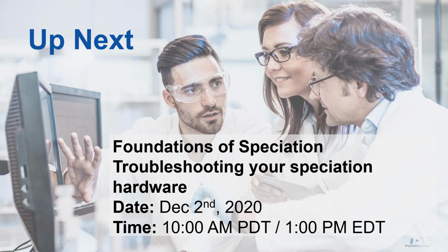Okay, and I know we're past the hour, but we've got a lot of good questions here. So those of you who can stick on, please do.